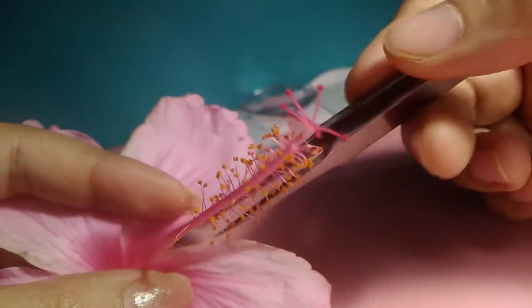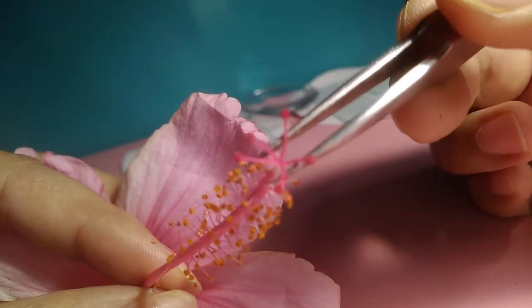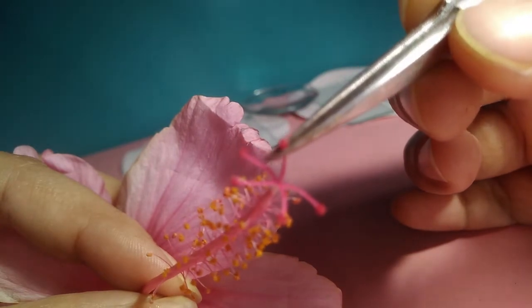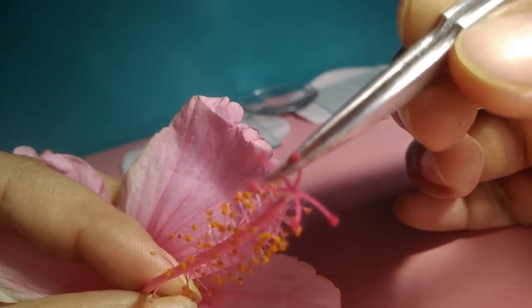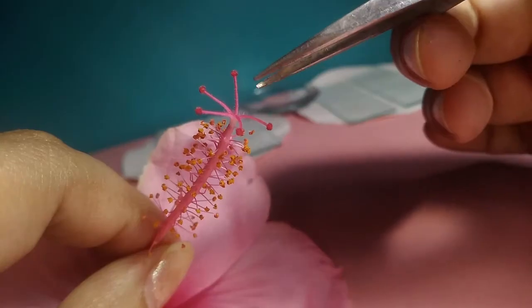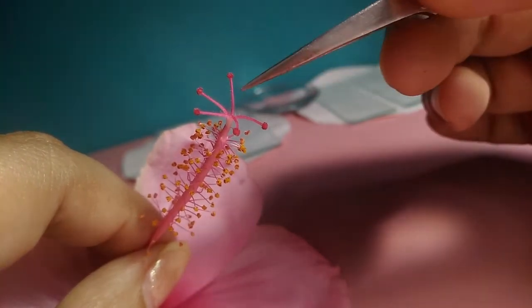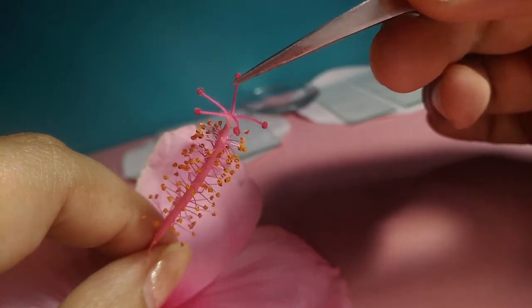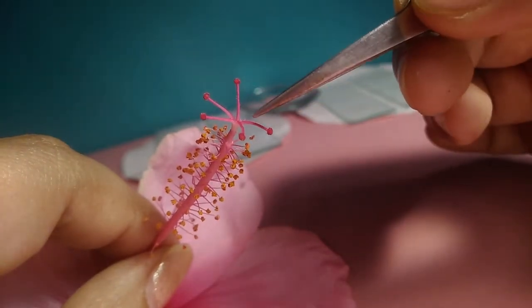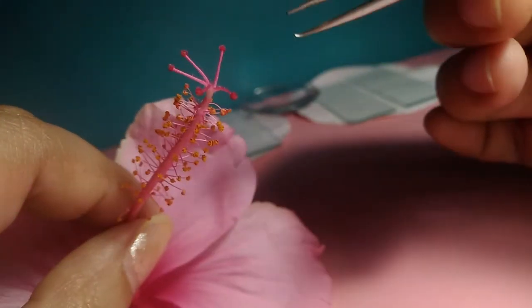Now the question is, what is this structure known as? So let us see. At the top we see that there are 5 branched tips. And at the top of each branch there is one globular red dot-like structure. These globular red dots are called the stigmas. Now in hibiscus we have 5 stigmas, 1, 2, 3, 4 and 5. And this stalk which is holding the stigma is known as the style. So here we have a branched style, and we have 5 branches of styles, 1, 2, 3, 4 and 5 again. Okay. Now what does the style do?